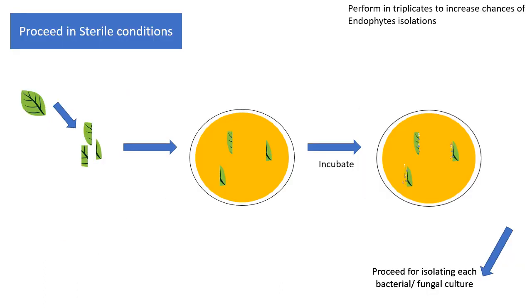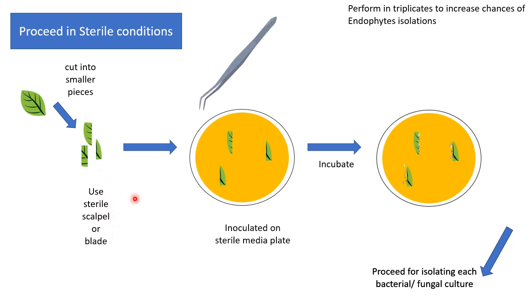Now proceed to isolation, keeping in mind that everything must be done aseptically under sterile conditions. Take your surface-treated sample and cut it into smaller pieces using a sterile scalpel or blade — this applies whether you are working with a leaf, root, or stem. Then use forceps to lift the pieces and inoculate them onto a sterile media plate.